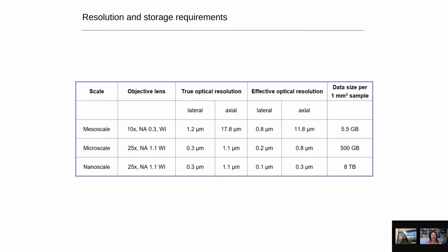All right. Next question. How long is the preparation suitable for imaging? Does it fade out or degrade? I think that's related to the previous one. If you image with the sample in PBS, you don't have any problem. At least I have experience imaging the same sample for a really long time, just for testing. But with water, you will see the degradation over time.